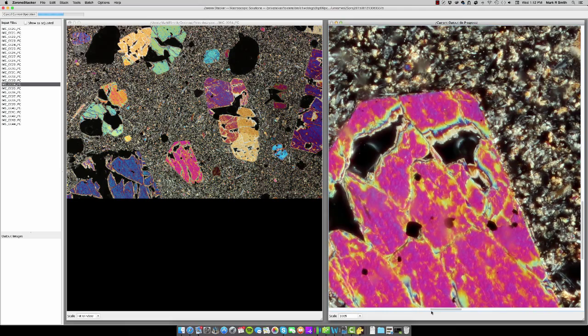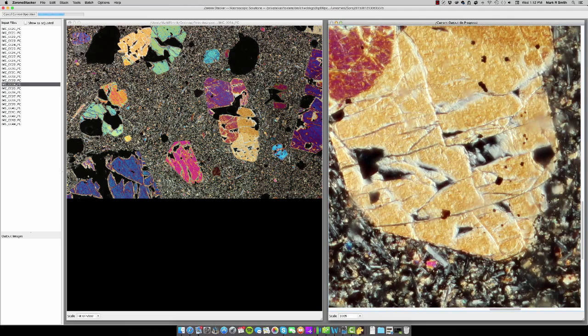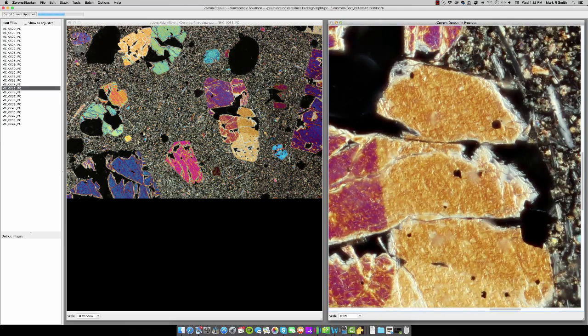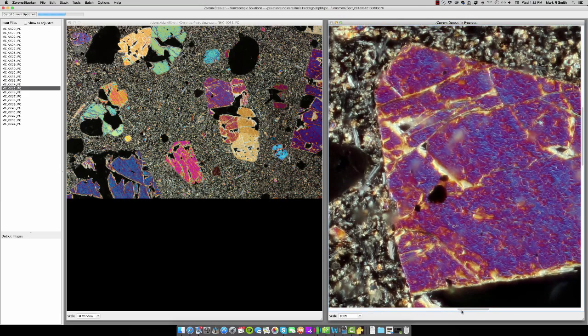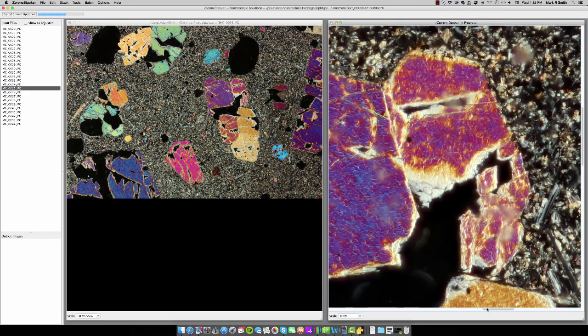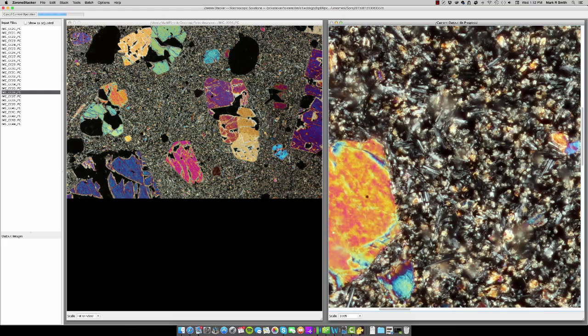What I'll do is I'll just pause it here and I'll basically move around. You can see that at 100% there's no loss in clarity or resolution in the image and we're not even finished processing this image yet.